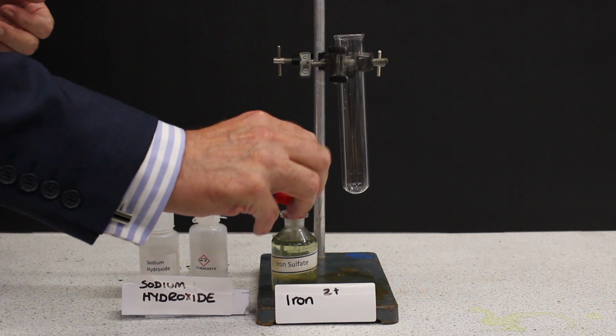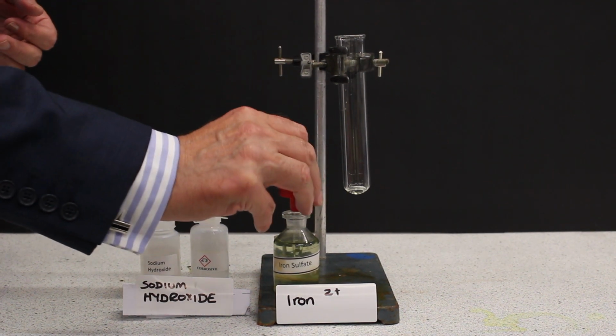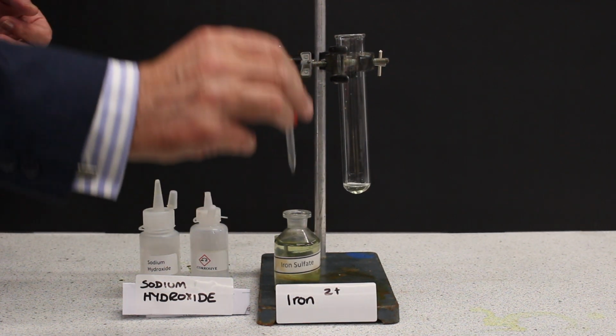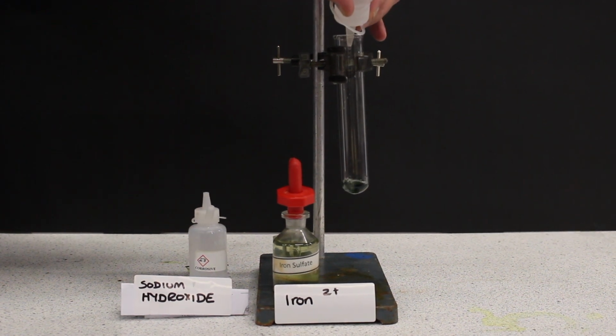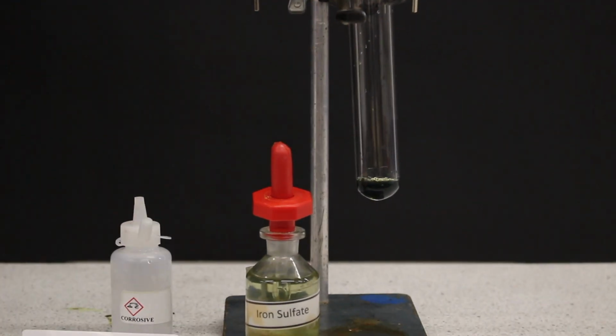So now let's look at our second experiment. Here we're going to put a few drops of iron(II) sulfate into a test tube, and this contains the Fe2+ ion, or more correctly the [Fe(H2O)6]2+ ion, and we're going to add a few drops of aqueous sodium hydroxide.